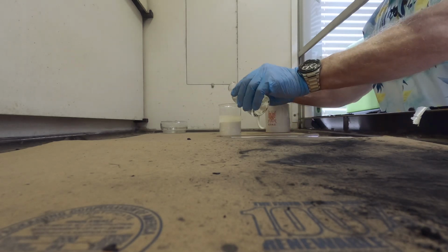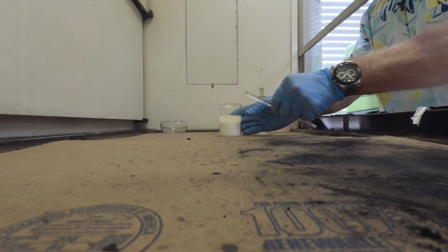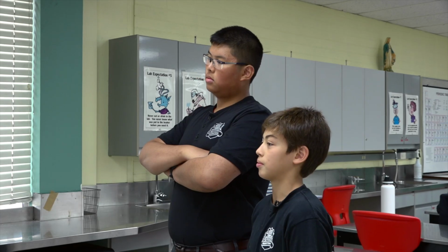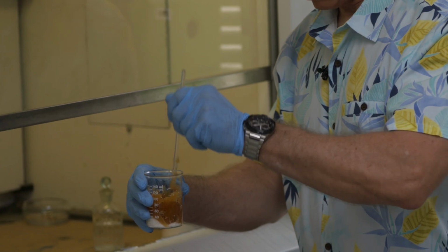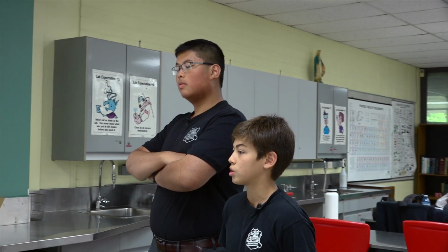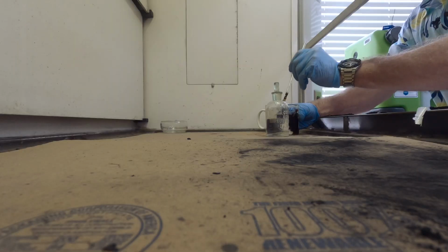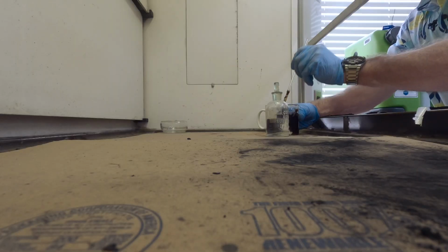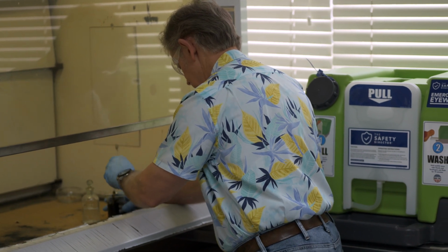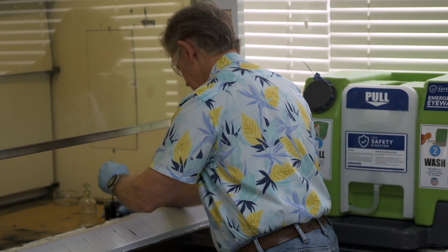When I pour the acid in, it's going to start turning black. Now, you can probably see the sugar starting to change color a little bit. Hope that I can generate the heat necessary. What's causing the color change? It's taking the water, the H2O, out of the sugar, and the black color that you see is just pure carbon.